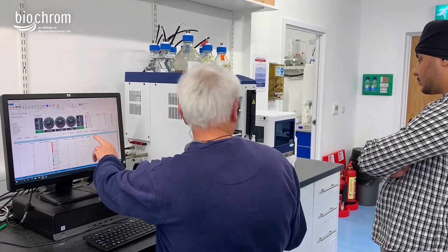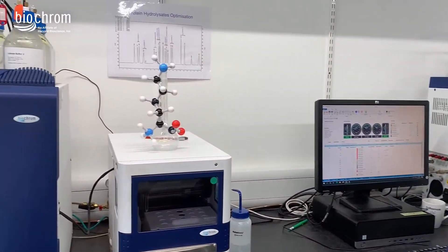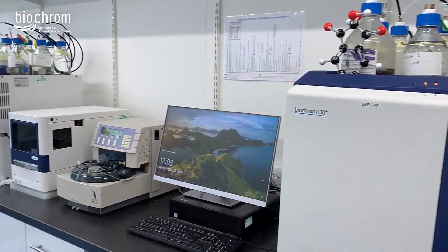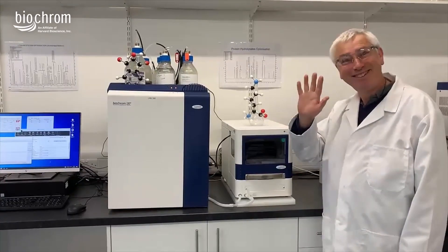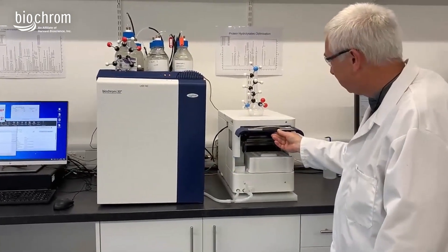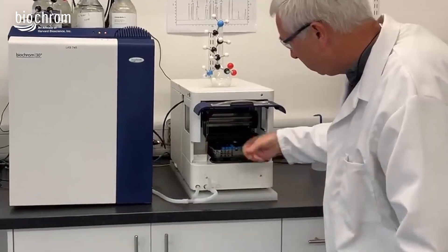You've got the small box, which is the auto sampler, you've got the big box, which is where all the magic happens, and obviously the PC. I'm going to show you the main key components and show you our labs. That's Dr. David Thomas — he is our chief chemistry engineer at Biochrom. He's going to show us around the instrument, starting with that auto sampler. That white bit he's taking off is the temperature control case.